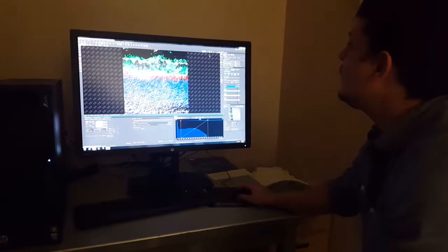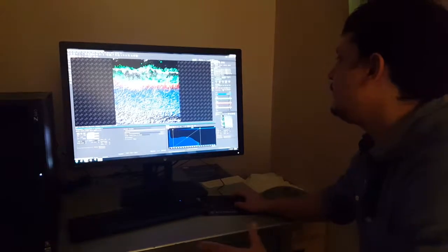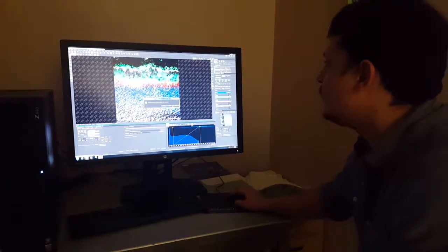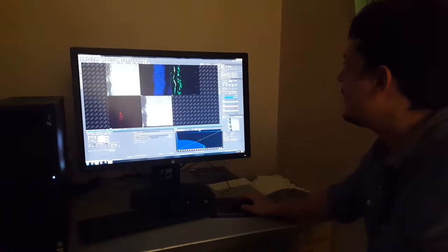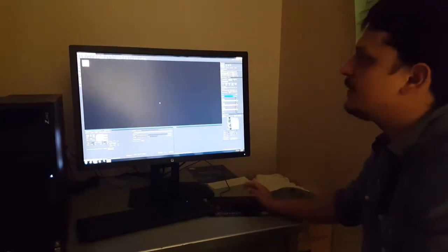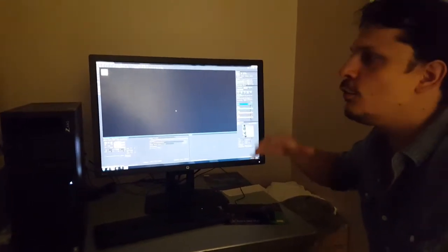We finish with all. If you're going to scan again or do something new, it's always good to clean your dashboard here, starting from zero. And this part of the video is going to go with the 4 channels.